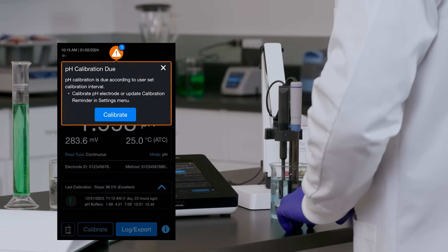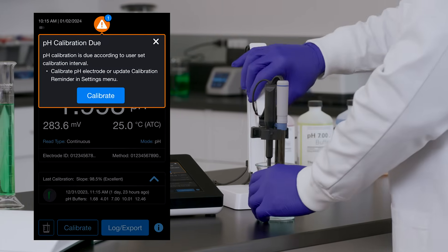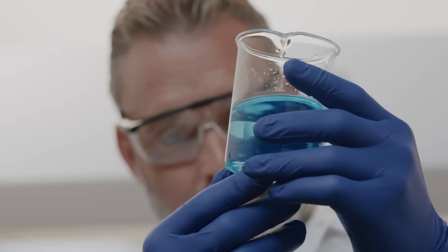Should you encounter an error, the Orion ProStar provides troubleshooting assistance.